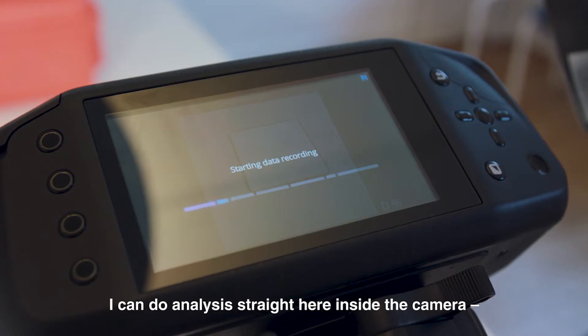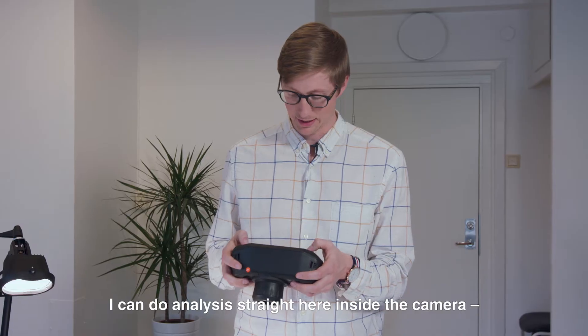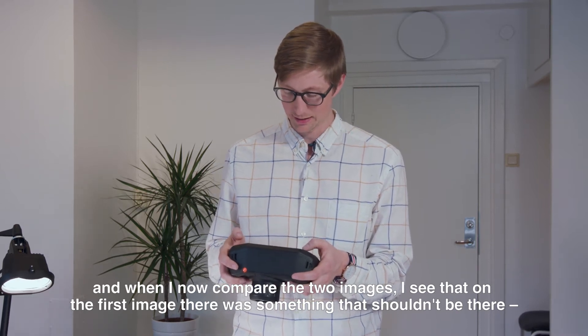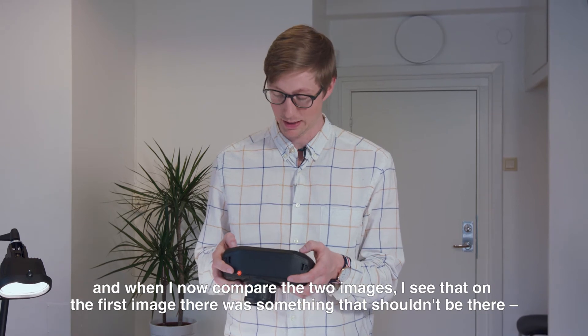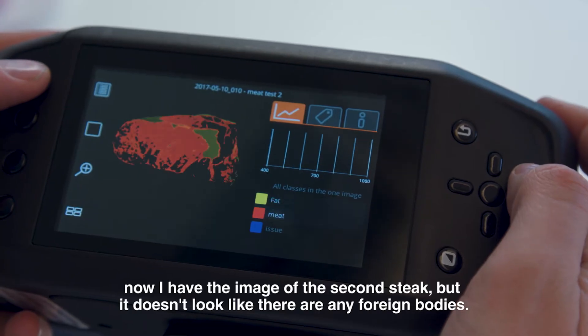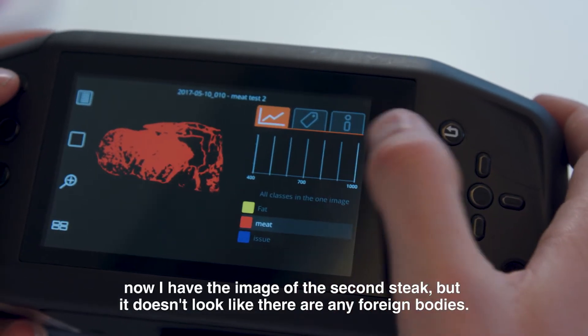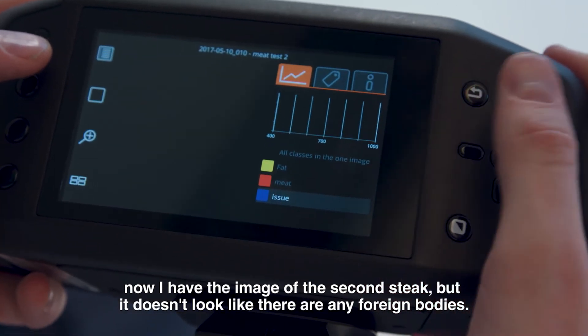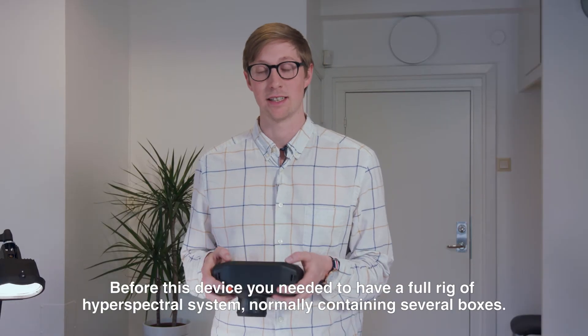I can do analysis straight here inside the camera, and when I now compare the two images, I see that on the first image there was something that shouldn't be there. Now we have the image of the second steak, and it doesn't look like there are any foreign bodies.